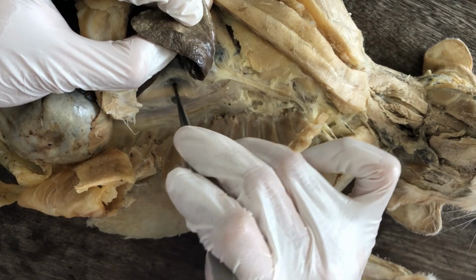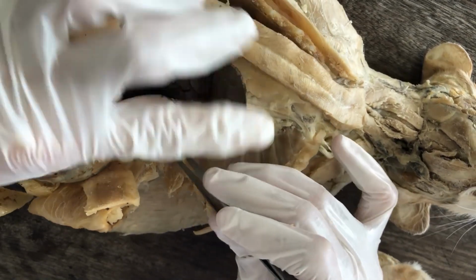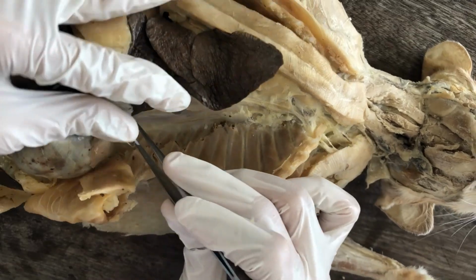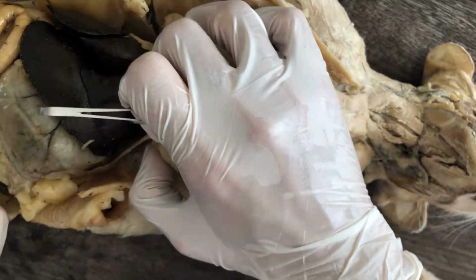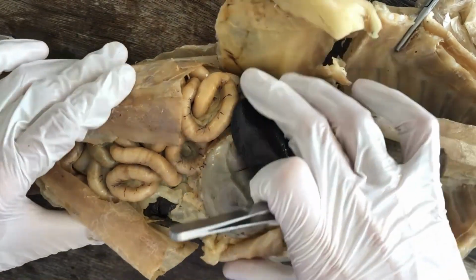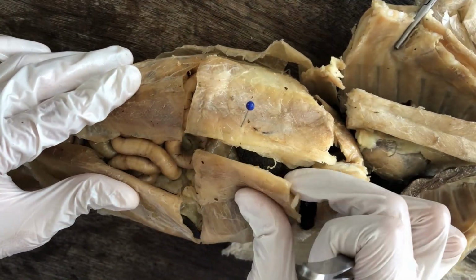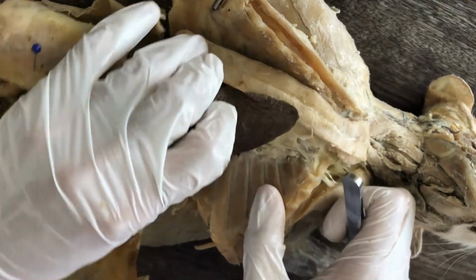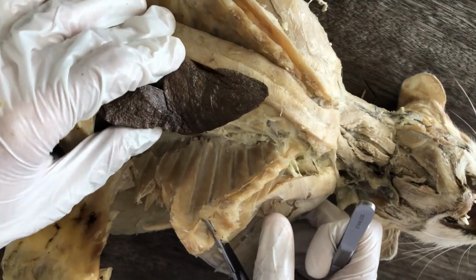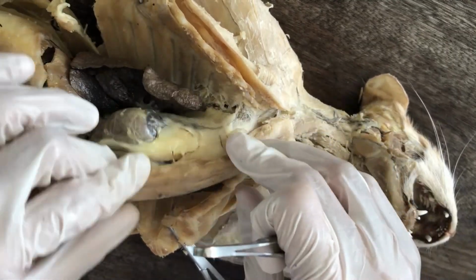And the one ventral to it is the esophagus. And both the aorta and esophagus will penetrate the diaphragm posteriorly, so that they will continue here into the abdominal or peritoneal cavity. There are also veins. So the aorta is an artery, the main artery, right, that carries blood from the heart to the rest of the body.